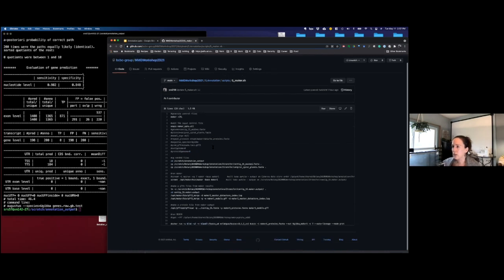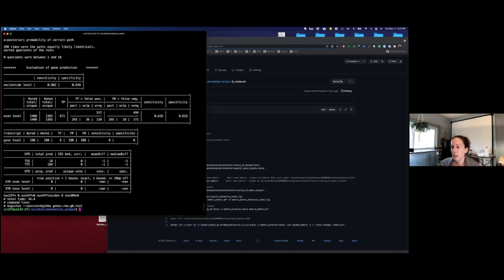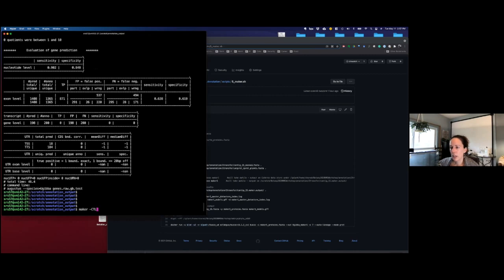Okay, so for Maker, let's just try this so you can get a feel for what Maker looks like whenever you're running it. Why is this frozen? Okay, so to get the control files, you can use this command. Maker generates, I think, 3 text files that contain information. One of them is for the general configurations, like where BLAST is, where different tools are found. One of the files that we'll look at briefly is where you actually put your input, which genome you're going to annotate, and how you want to annotate it.